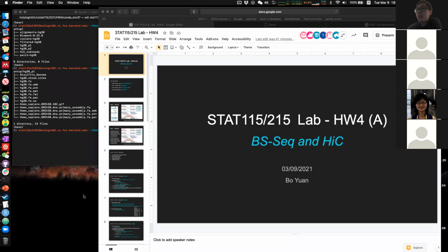Okay, so let's start from our first topic. I think we have already covered BS sequencing in the class. So in this lab, I'll basically go over all the things you would need to finish the homework.